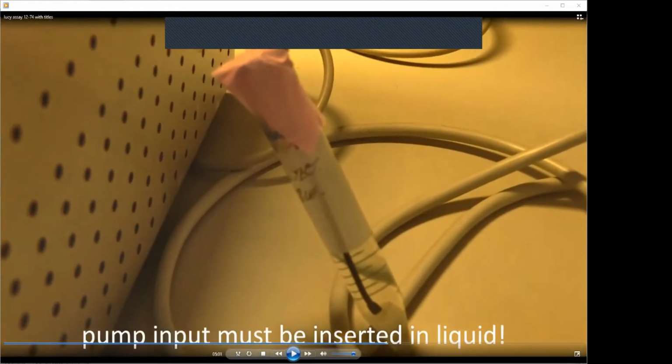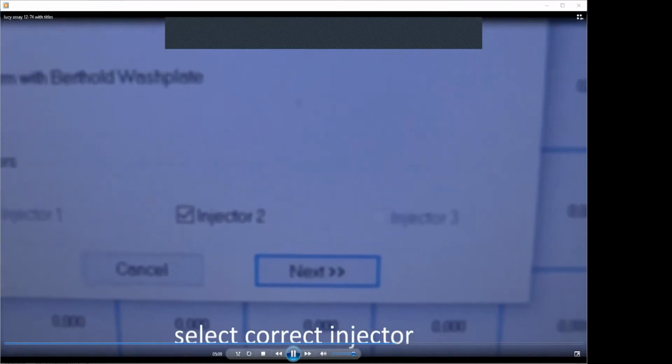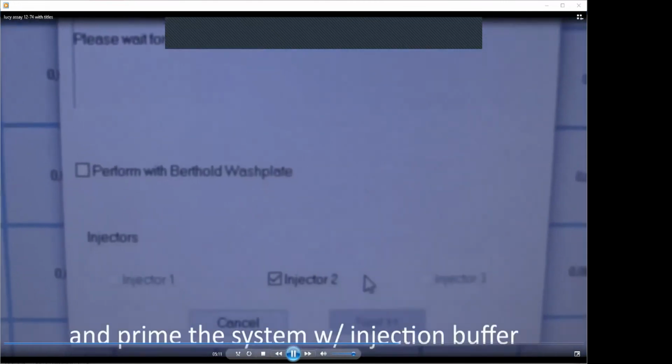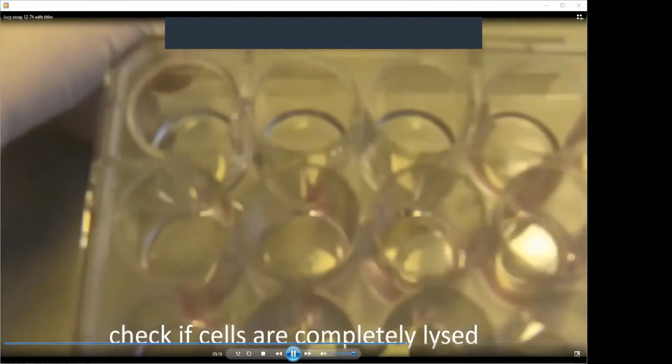Then you see here is the tubing, and this is a special filter where the solution comes in. It has to be properly inserted. I'm showing it only because of the detail that sometimes it's not properly fixed there and it sucks in air and then the measurement doesn't work properly. So it has to be checked carefully every time. Then you have to select the injector because these machines have several injectors. In our case, it's number 2. And we start with injecting the injection buffer, priming.